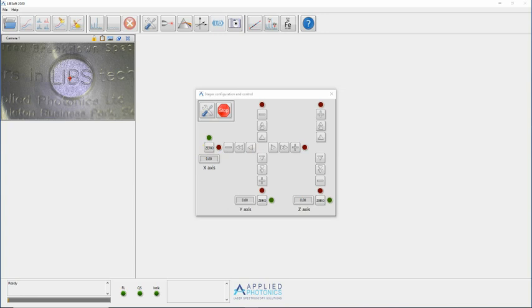It is important to note that the controls for the X and Y axes are laid out in such a way as to indicate the direction in which the analysis position on the sample will move when viewed from above. It is easiest to imagine the top left-hand corner of the sample when viewed from above as the origin of movement, so the zero position.